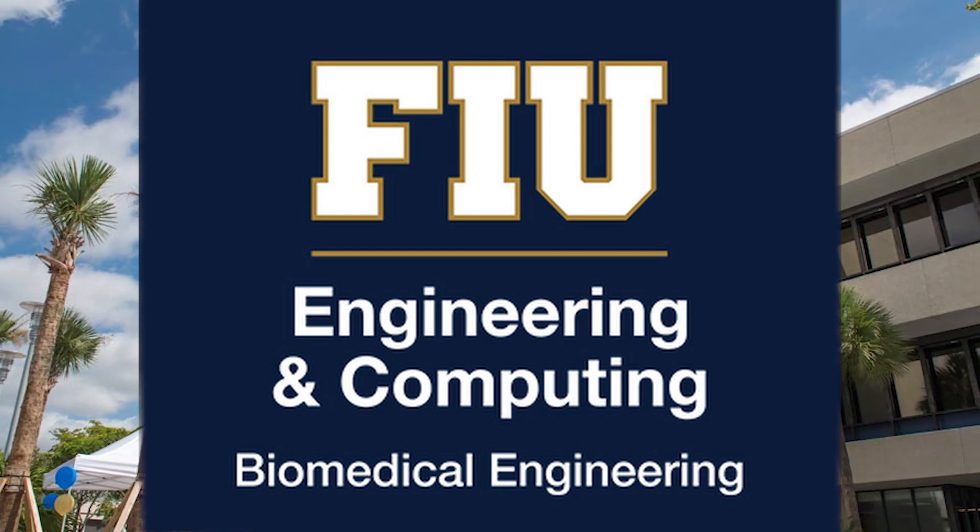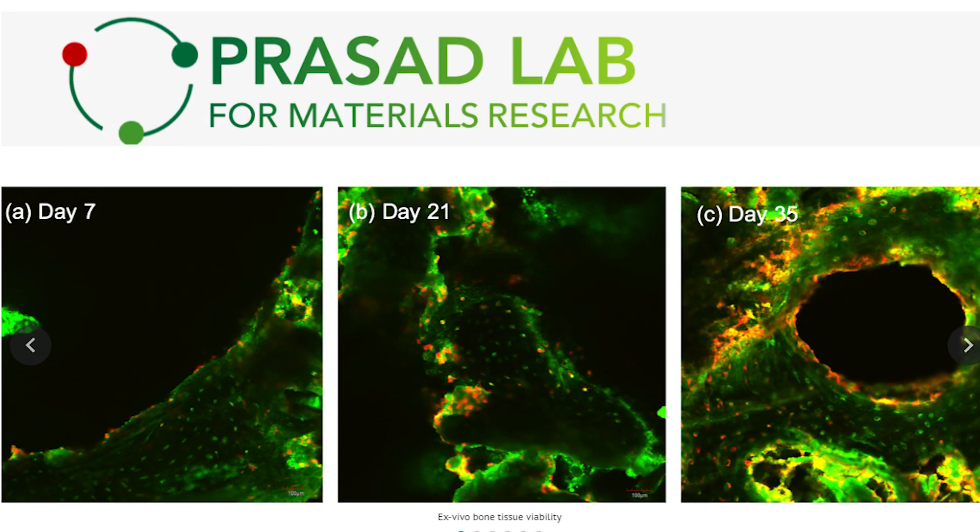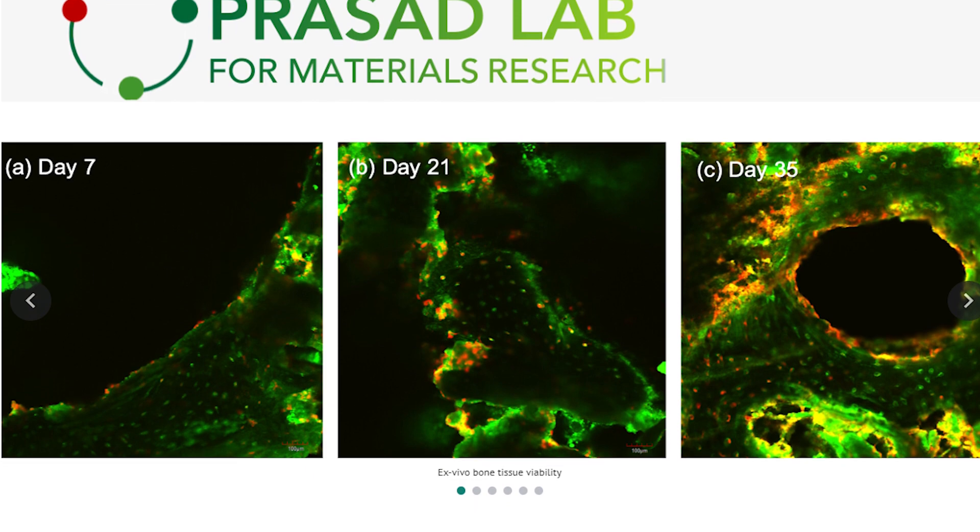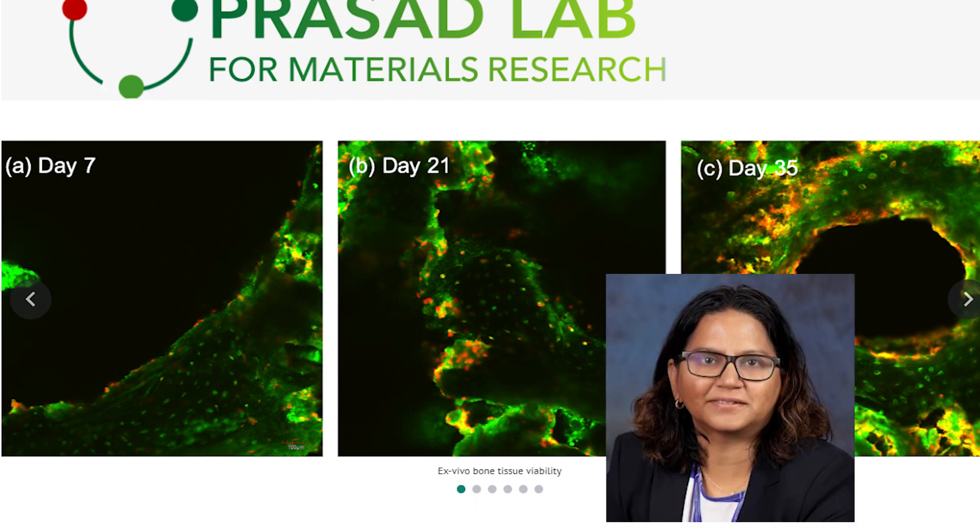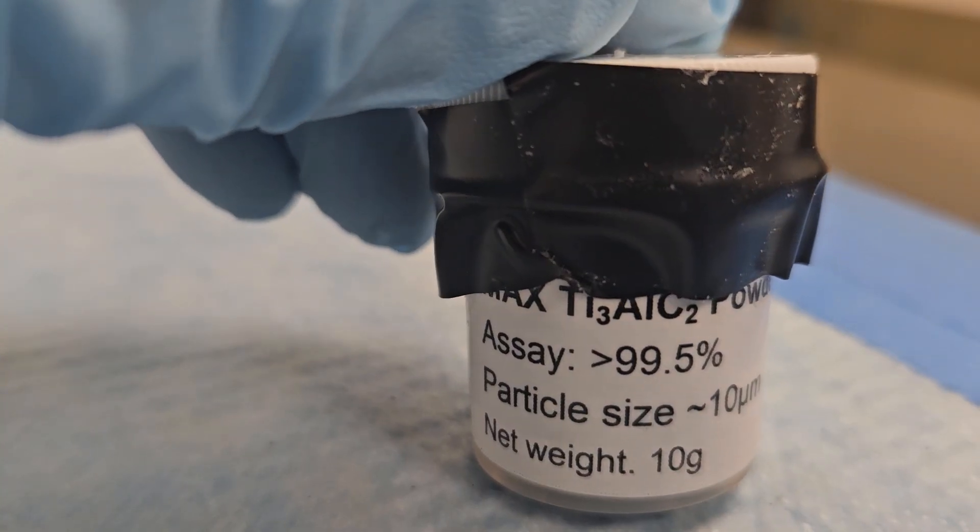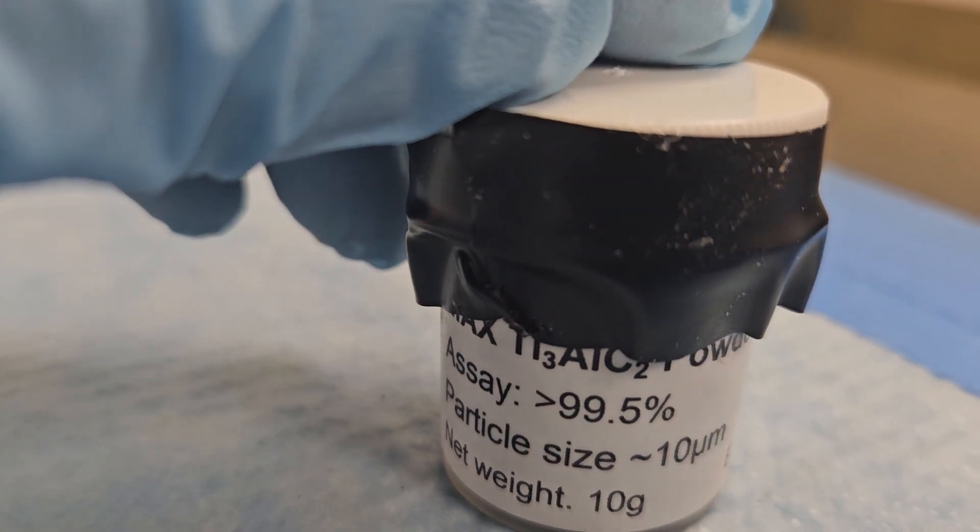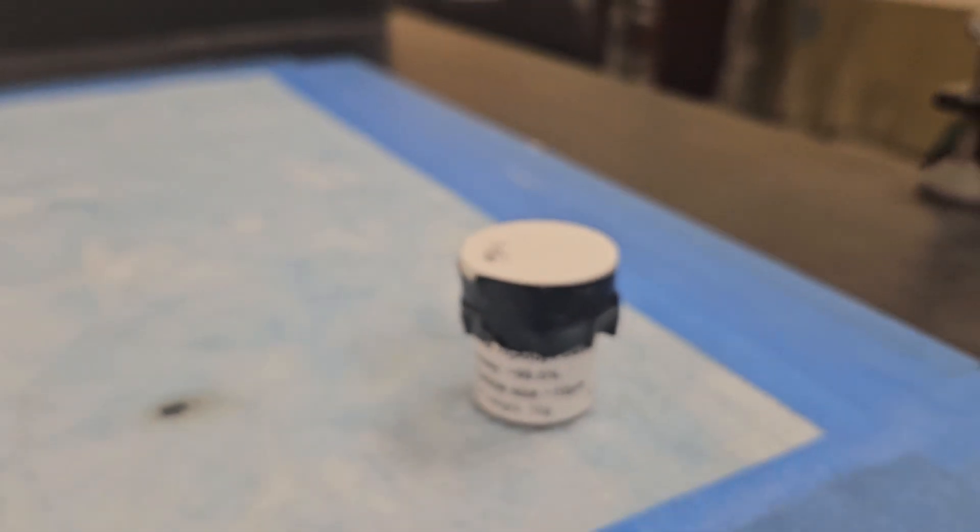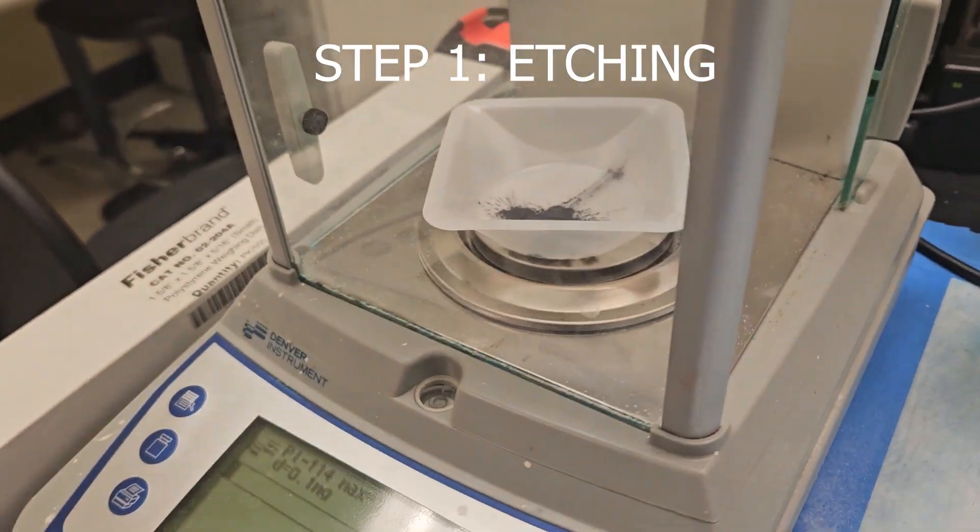Welcome to Florida International University Department of Biomedical Engineering and the Prasad Lab for Materials Research, hosted by Dr. Anamika Prasad. In this video, we'll be covering the steps and the synthesis of single-layer MXene flake, which starts with the etching process of our MAX phase powder.